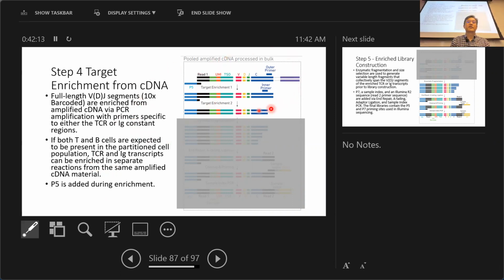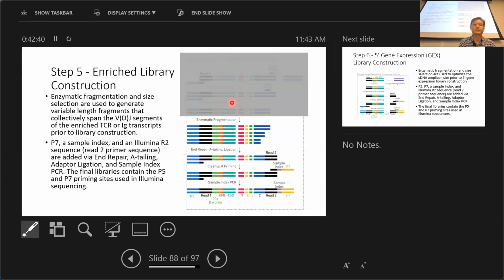Okay, so this figure shows T cell or B cell receptor sequencing. You see in the middle, you have this VDJ fragment here. The primer was designed specifically to amplify those regions, not all other regions. So after you sequence this region, you can reconstruct and say, okay, for this cell, you use V1, D2, J3. For another cell, you use V2, J1, D something other. Okay.